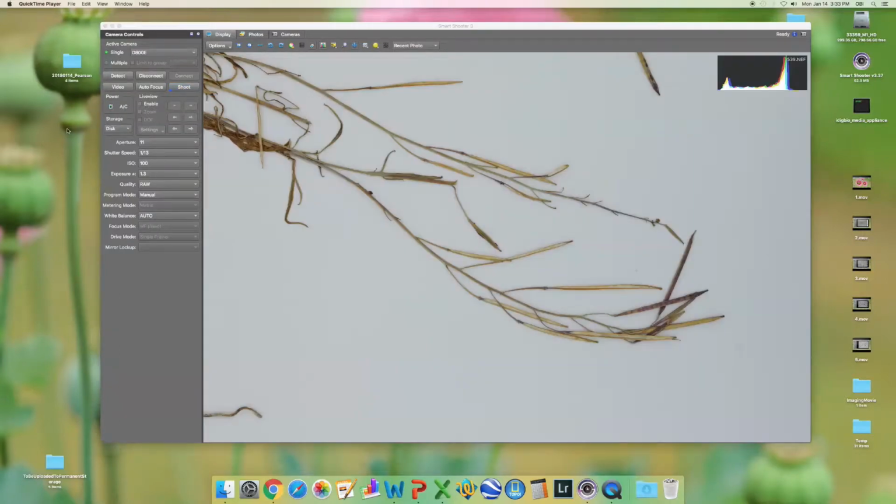At the beginning of the next cubby, you'll want to run through the autofocus procedure again, just to make sure that everything is still in focus. Or you could try a couple specimens, and if you're still happy with the focus, just continue with the manual focus that you already set.